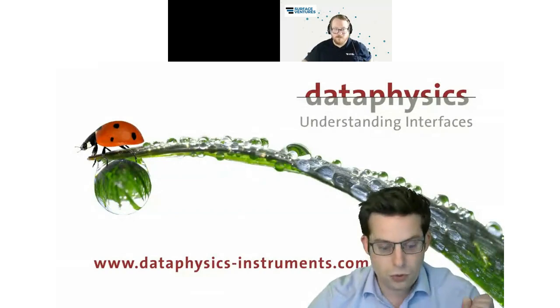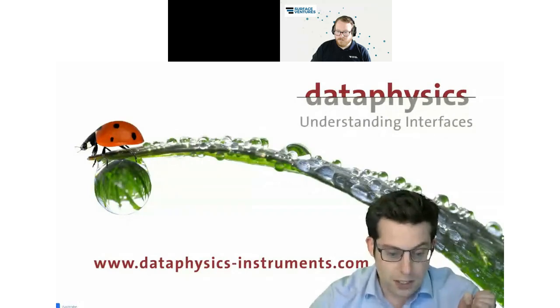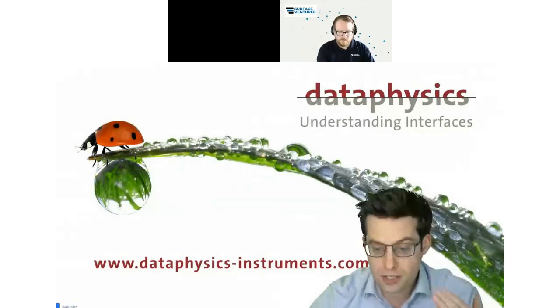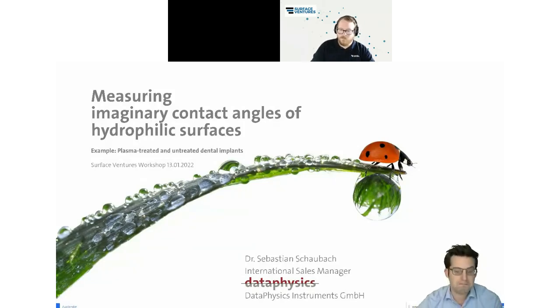What I would like to do with you now first is show you a couple of slides. And based on these slides, afterwards we will show you how this kind of force tensiometer is indeed working. So let me first share with you our slides here. So today we talk about measuring imaginary contact angles on hyperhydrophilic surfaces.